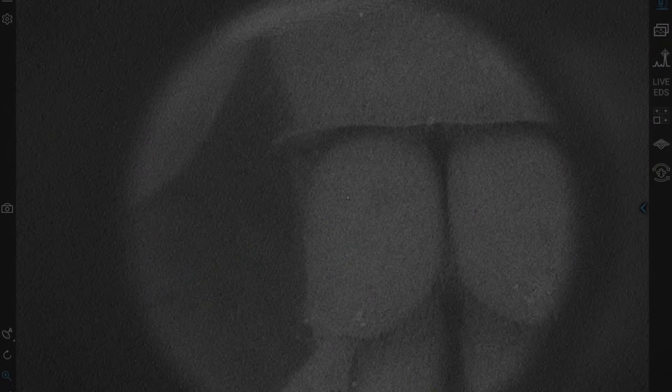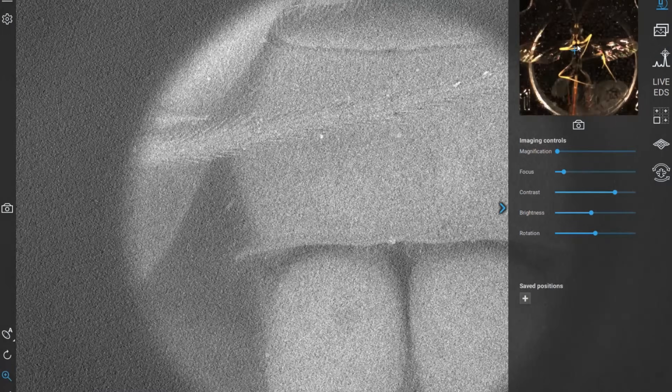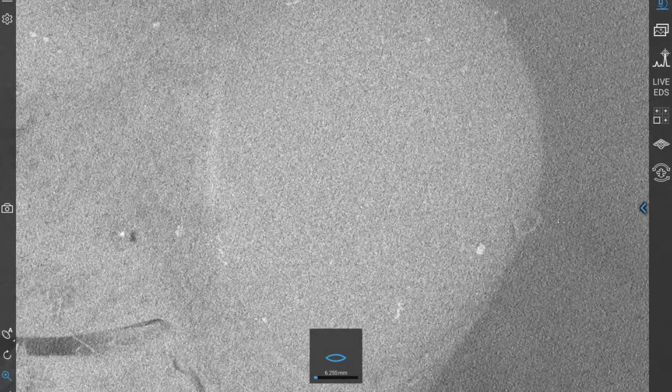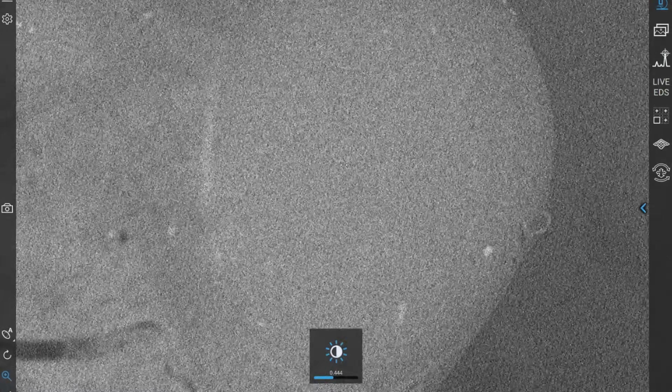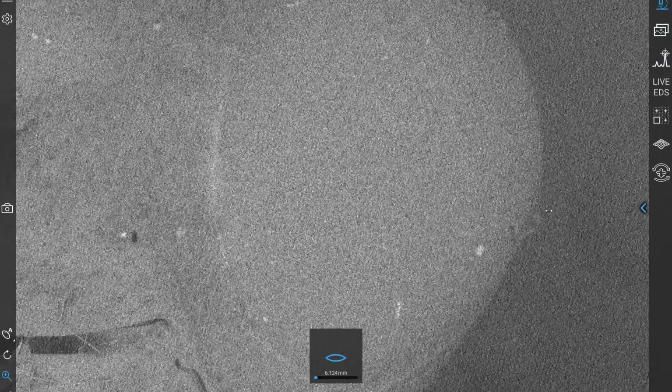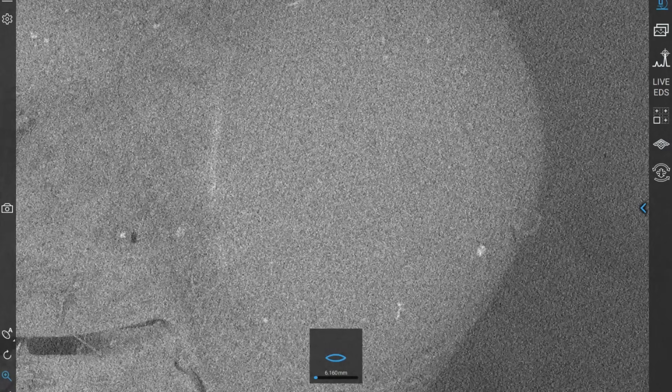Insects are fairly robust and image quite well, assuming they haven't had a chance to dry out excessively. So I got this under the electron beam without any fancy coating and managed to get some good images.